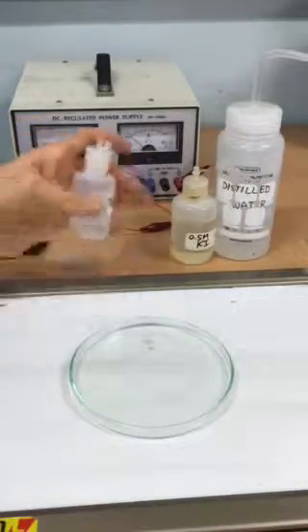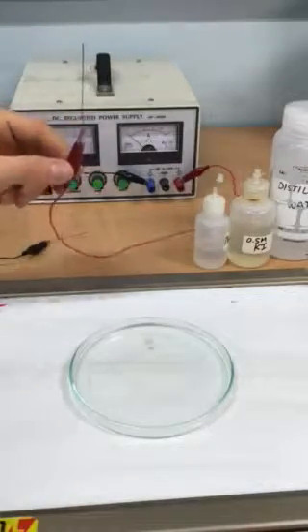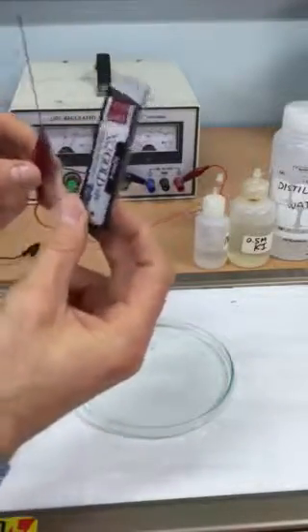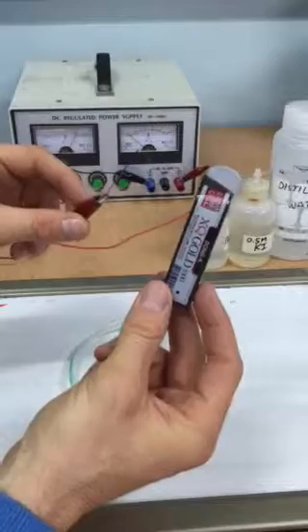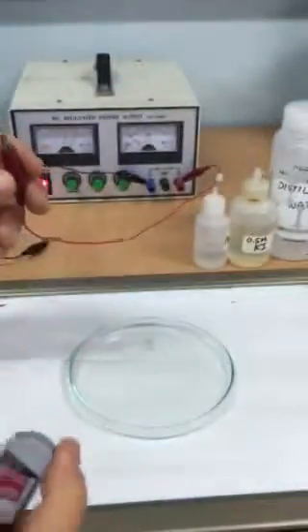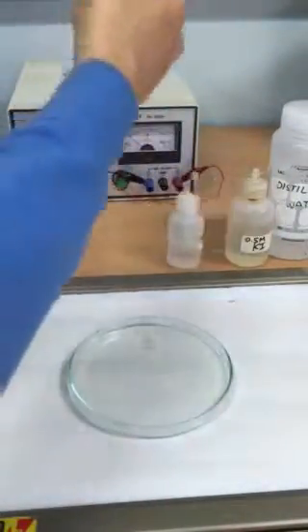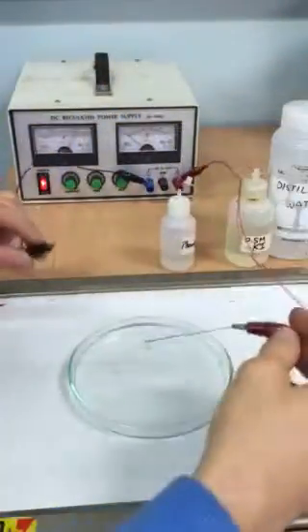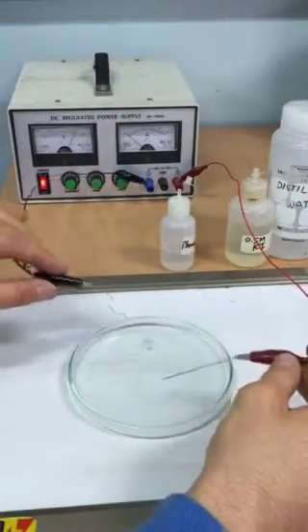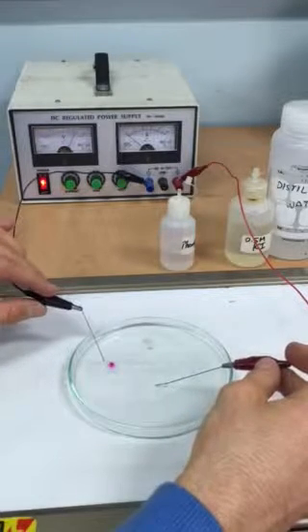And here I have a power supply. So these are pencil rods. So just the lead of your pencil, which is actually made of carbon. But it does still say lead there, but it's actually made of carbon. And I take these carbon rods, these graphite rods, and I place them into this solution. And what we're going to do is we're going to electrolyze this solution of potassium iodide.